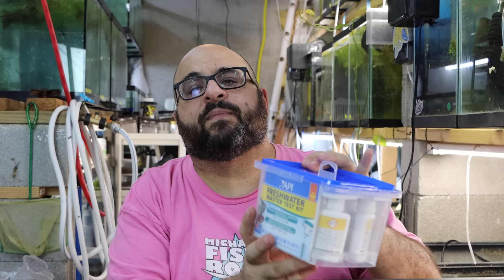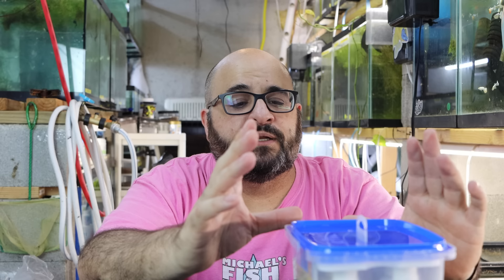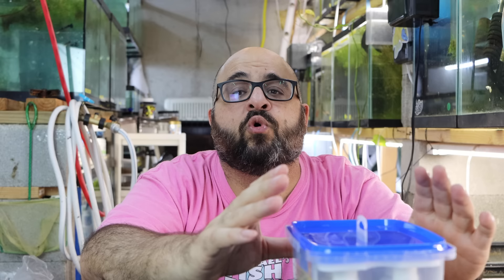Today we're going to talk about the API Freshwater Master Test Kit and how to test your water. Now, admittedly I haven't tested my water in probably 18 months if not longer — is that the best thing? No. But you definitely need to know how to test your water, especially if you have new aquariums or you're new to the hobby.